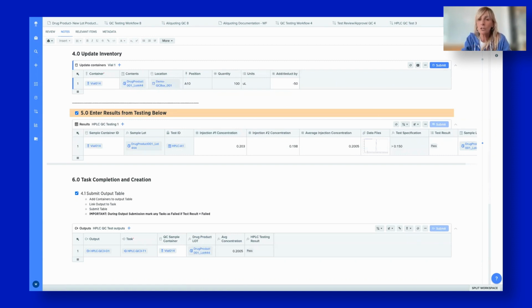to configure the structure and lock down workflows, but also supports research flexibility. How workflows connect teams and streamline the communication and task completion. How Benchling allows teams to easily set and track chain of custody of each sample and each aliquot, and how centralizing all the information related to samples, tasks, teams, and assays empowers the organization to do more with the data.